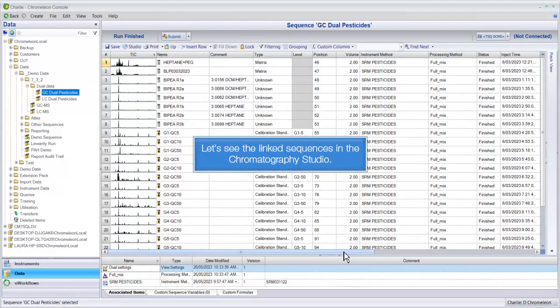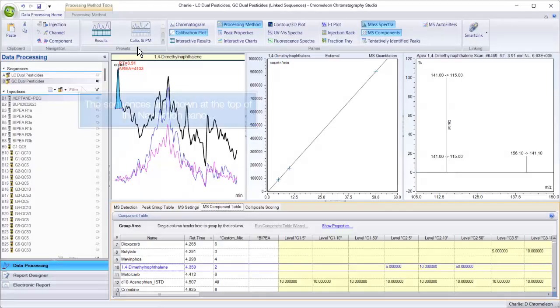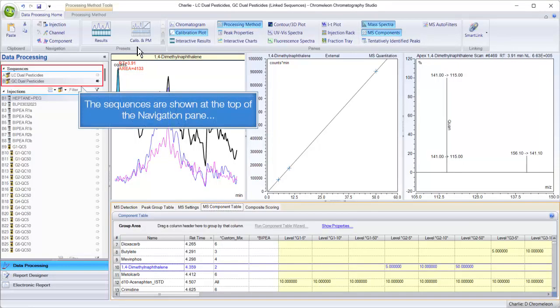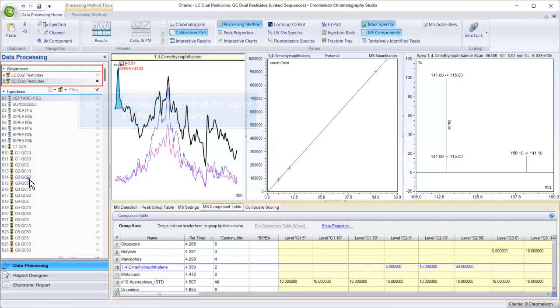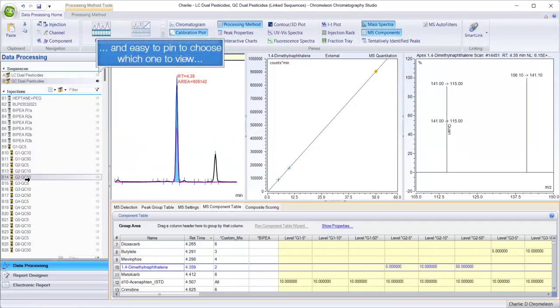Let's see the linked sequences in the chromatography studio. The sequences are shown at the top of the navigation pane and easy to pin to choose which one to view.